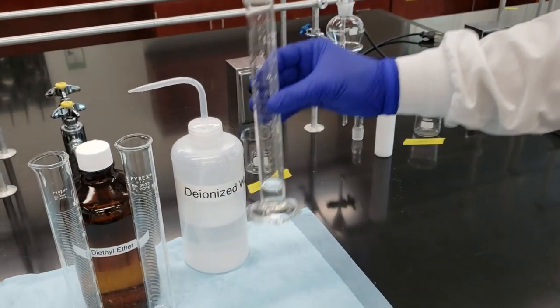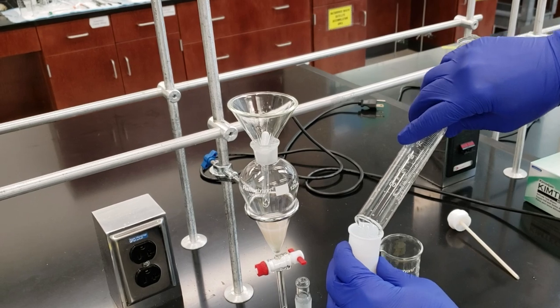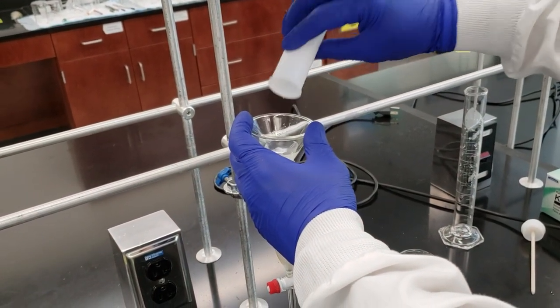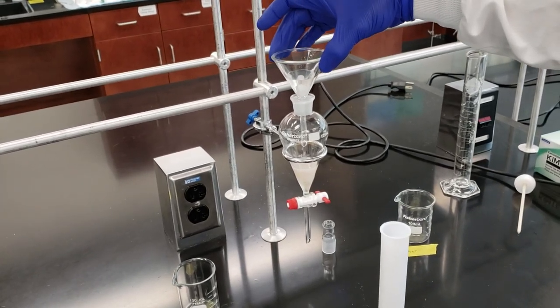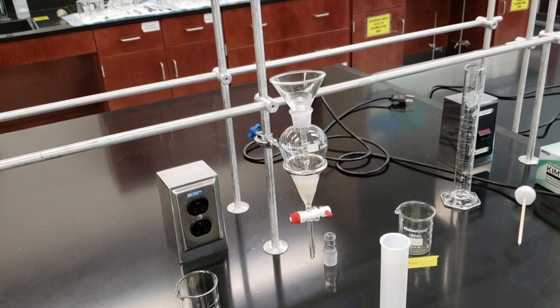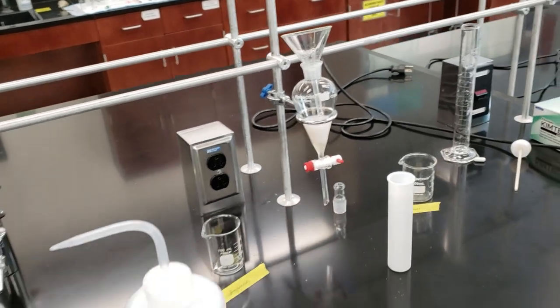Next up, we'll take 10 milliliters of our distilled water, or in this case, deionized water, and pour that into my reaction vessel. Swirl it around a little bit and pour it back through. Let that drain down. And in actuality, it looks like our stirring bar is blocking us a little bit. I'm going to get some forceps real quick, and I'll go ahead and pull that out. We'll set that aside as well.